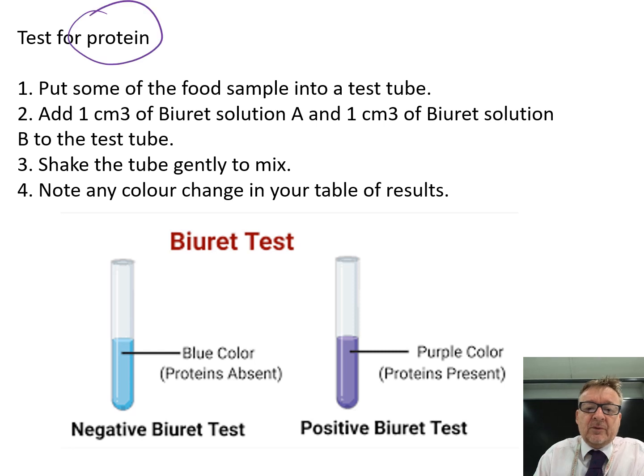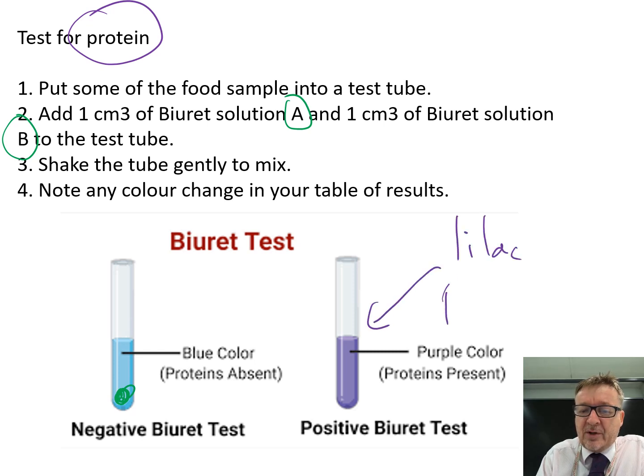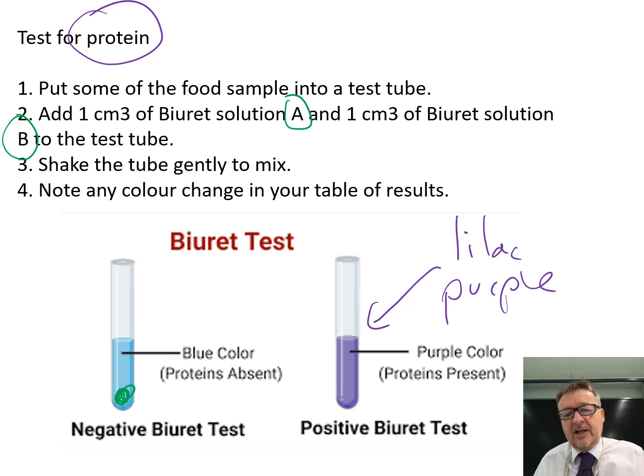Test for protein. Put some food sample into a test tube. Add one centimetre cube of Biuret solution A and one centimetre cube of Biuret solution B. Sometimes they'll be combined together, but often it'll be two different solutions. Give it a quick shake and record any colour change in a results table. The positive colour change is it goes a lilac purple colour. Remember it starts at blue, similar to Benedict's, and then goes to purple.